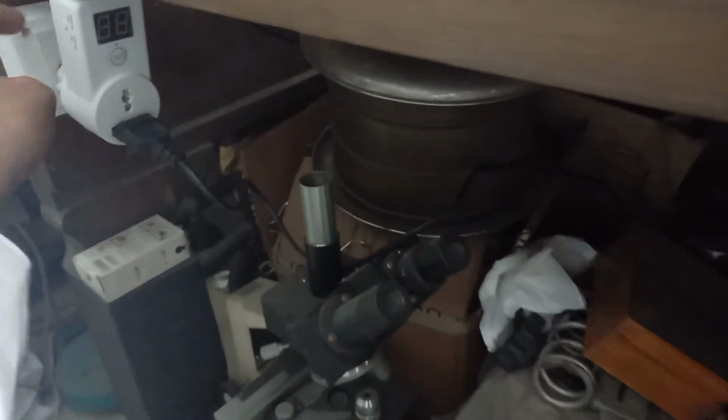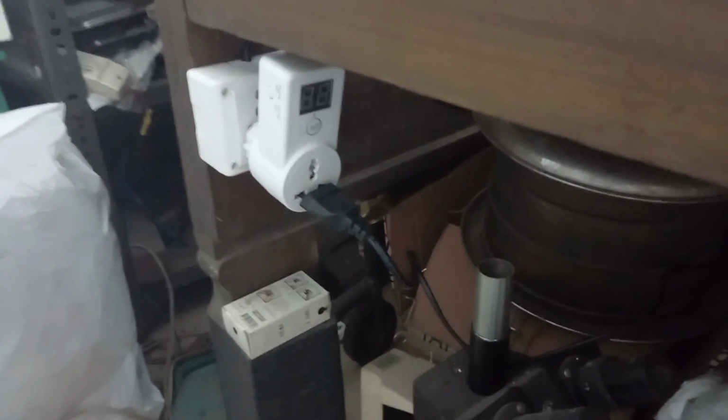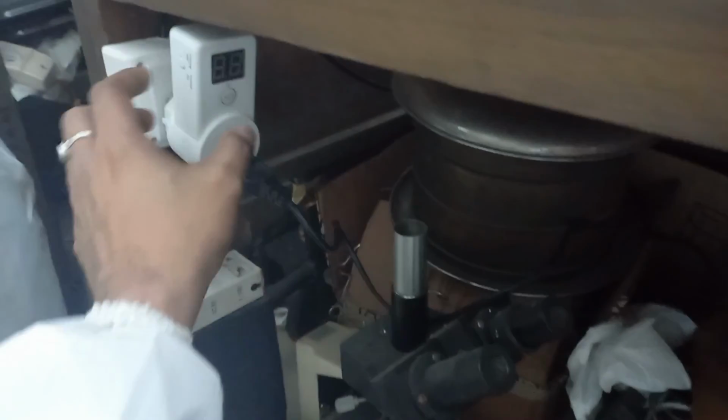Now I am just manually switching it off, and you can see. This is the timer. When you first switch on, it shows 88, and your UV lamp will just light up and switch off. Your timer is ready.